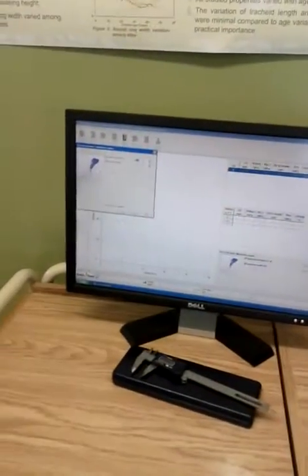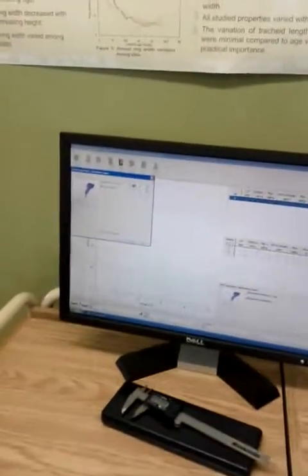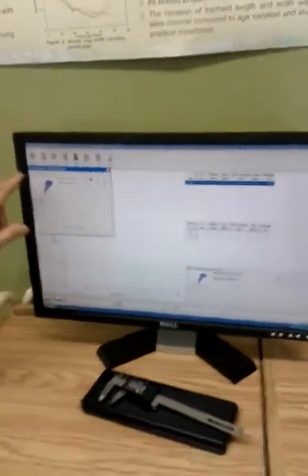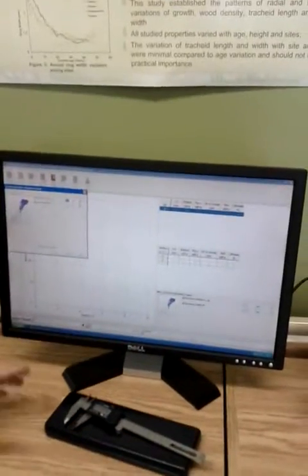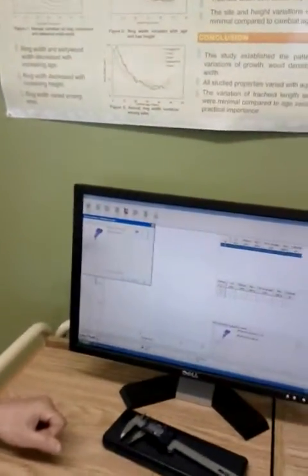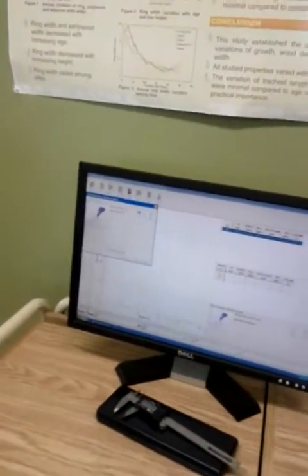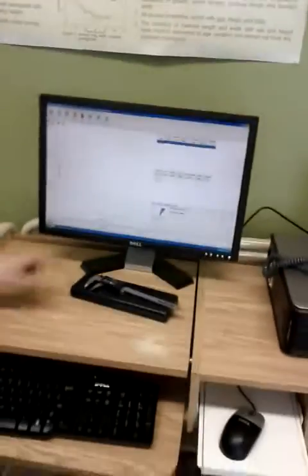Then it will ask again the size. So if you forgot to take the measurements, then you can do it. You can ask the machine to ask you or not. But most of the time, even when I put the sample on the machine, I forgot to measure. Then I had to take it out, measure, and put it back. Then this is okay. Then it goes on. You see the curve.